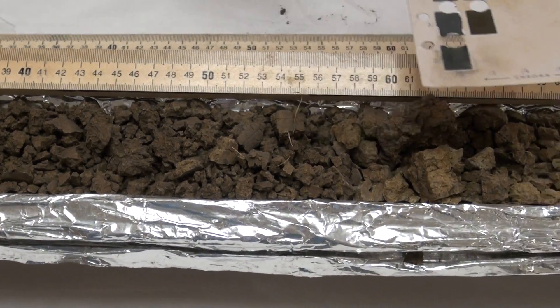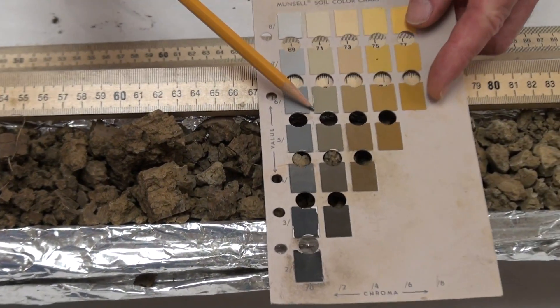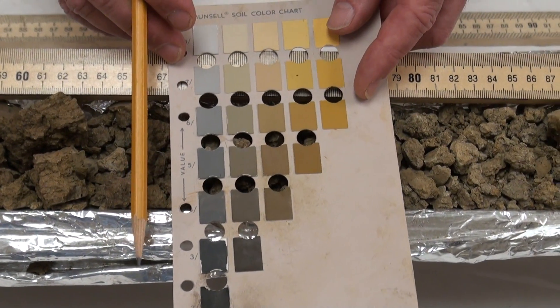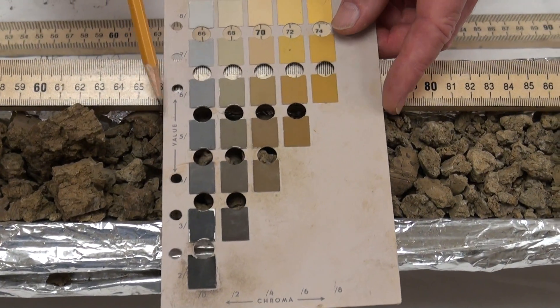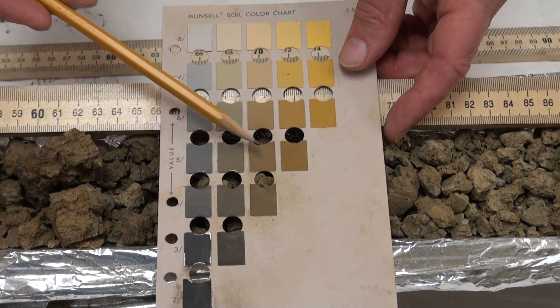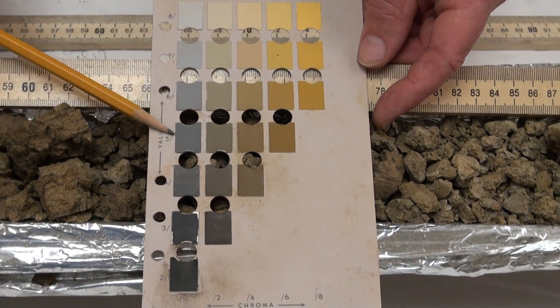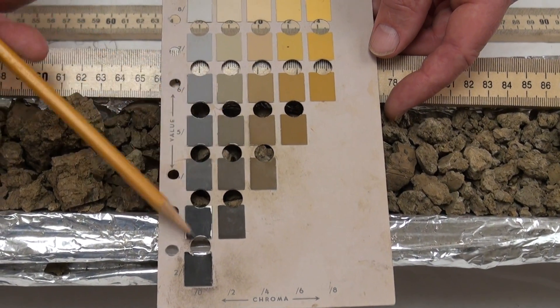Continuing with dry soil down to 70 centimeters. A little bit different color here. Now our chroma is increasing, and the value here looks to be between 4 and 5. Still on the 2.5 yellow page, and chroma 4.